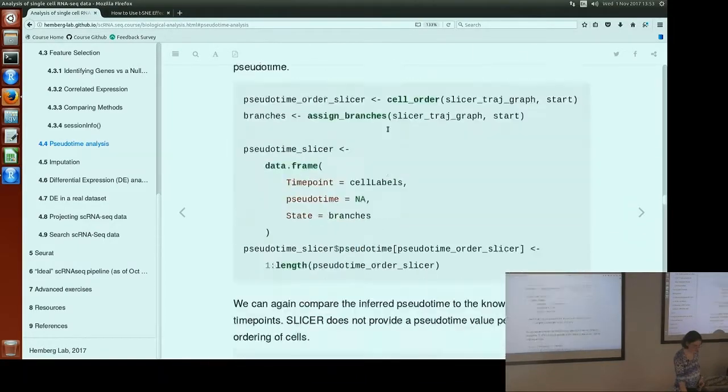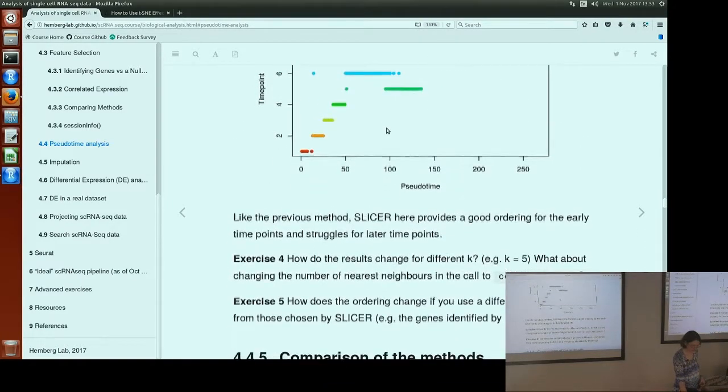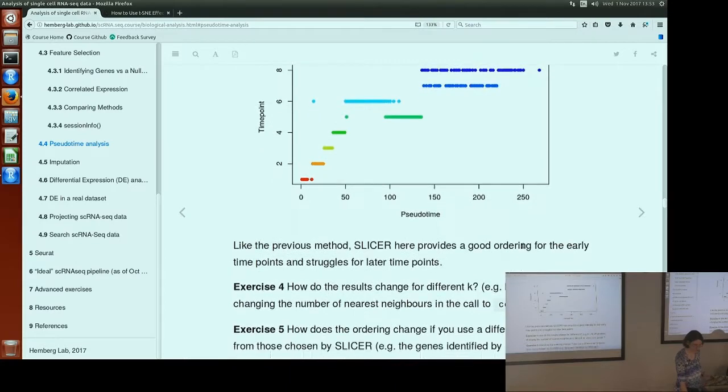And then, yeah, different case shouldn't have had too much of a difference on slicer, but again, extreme values would cause it to break.